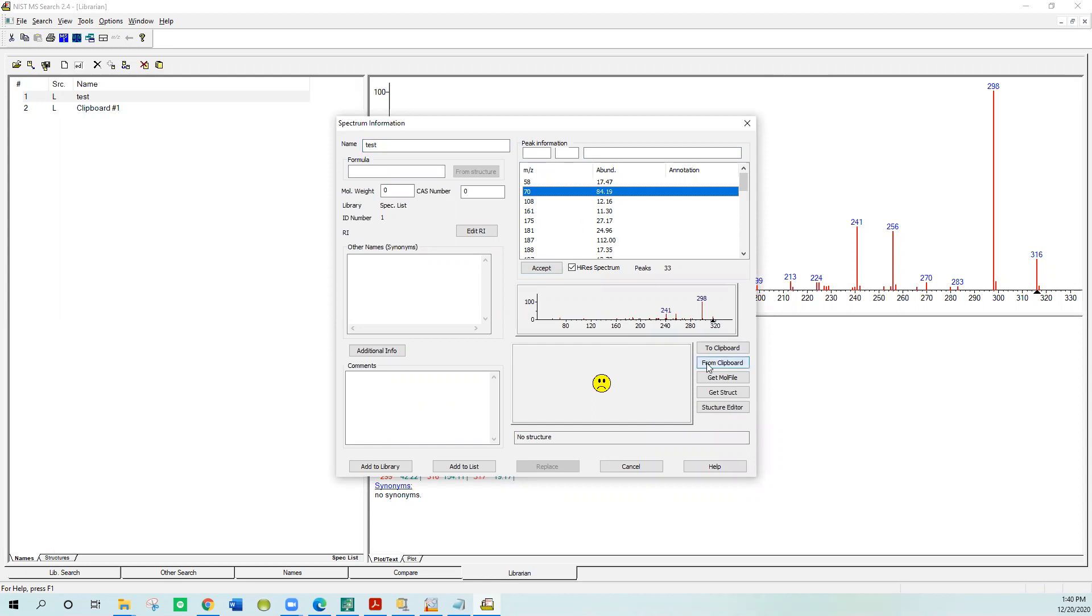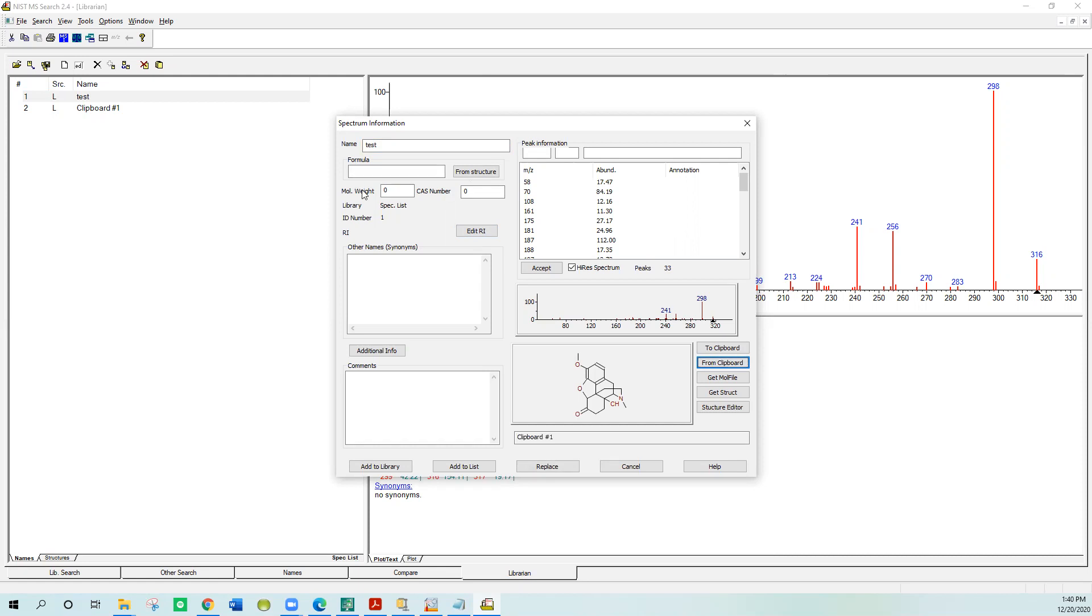It doesn't have a structure, but we'll get a structure here. We'll bring it from the clipboard. That's the structure that we had in our clipboard. It pops in here. What you want to do is say you want to calculate the formula and the molecular weight from the structure, so it automatically does that for you.